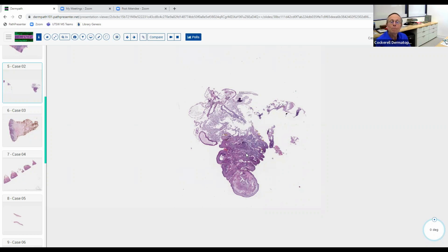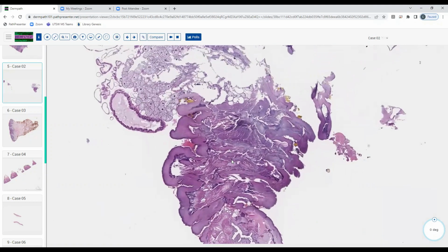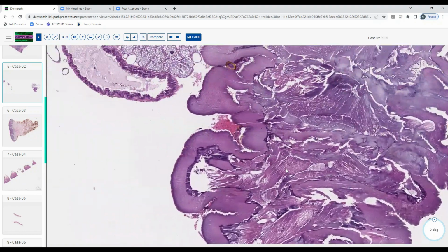That's good. Awesome. And then aligning with that, I didn't really see any epidermis going on here. I see a lot of non-human like structures. Okay. So there's these exoskeleton looking structures, like an outer wall.